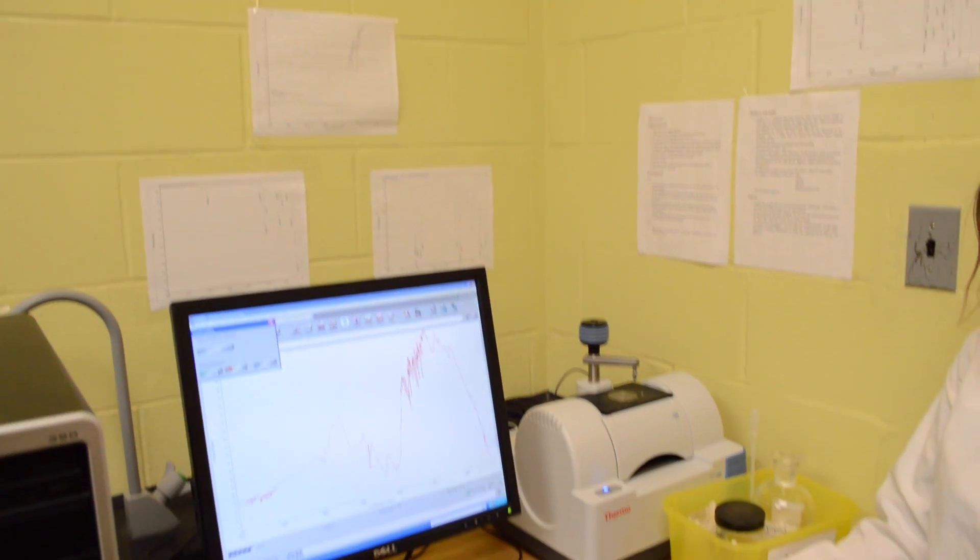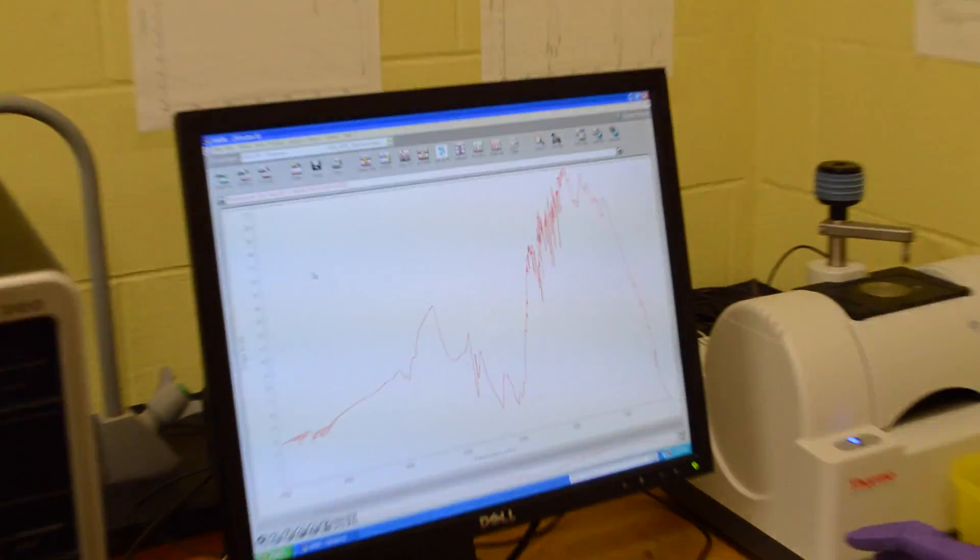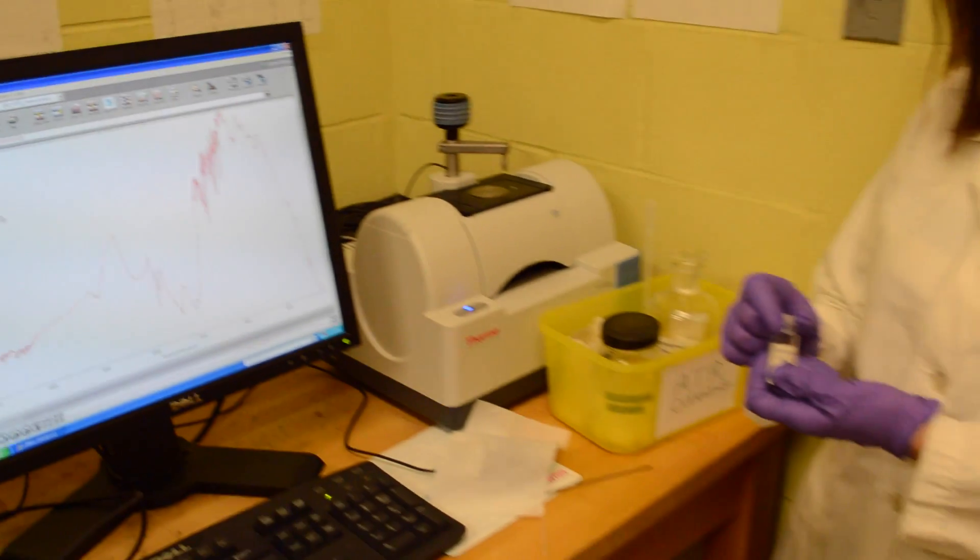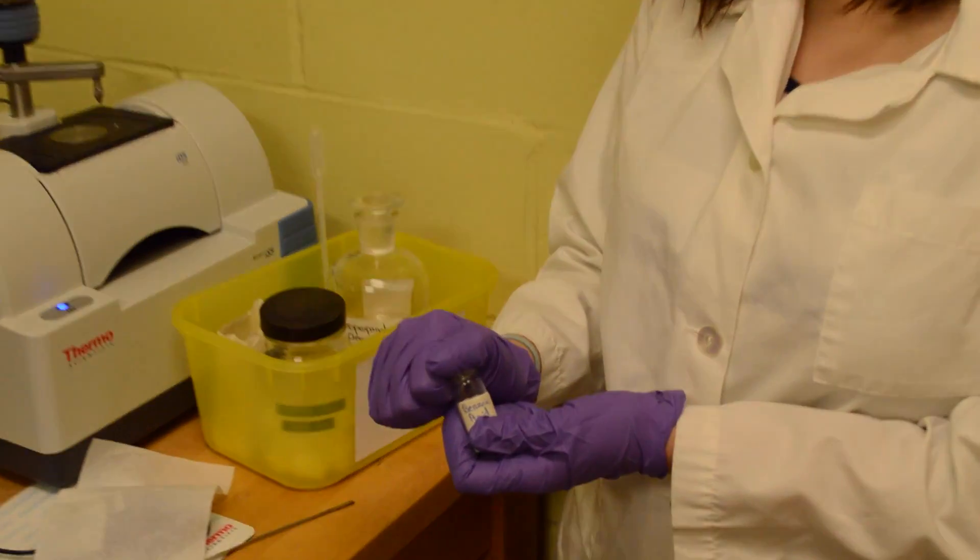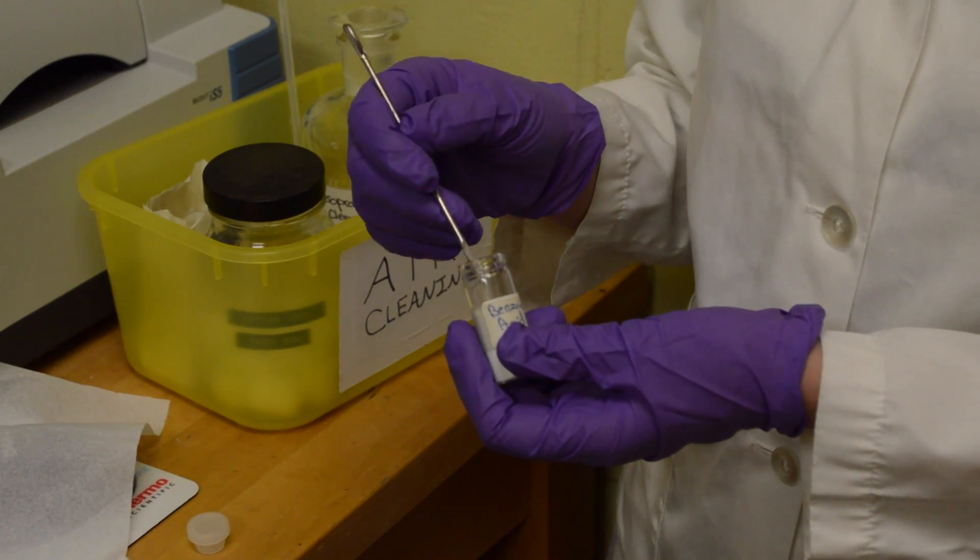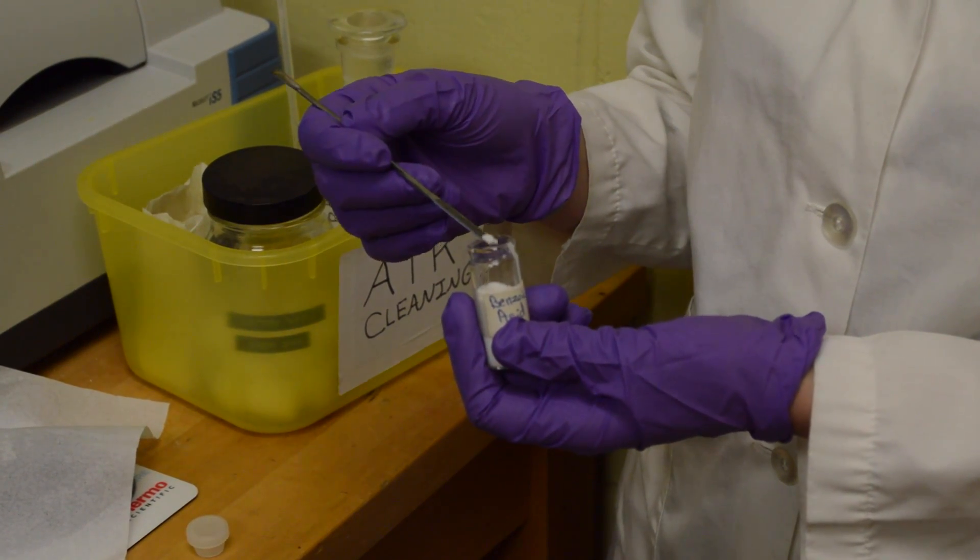We're going to add that to the window, click yes. Now we're ready to look at our sample. Take a small amount of sample with your little scoopula or spatula, just about this much.